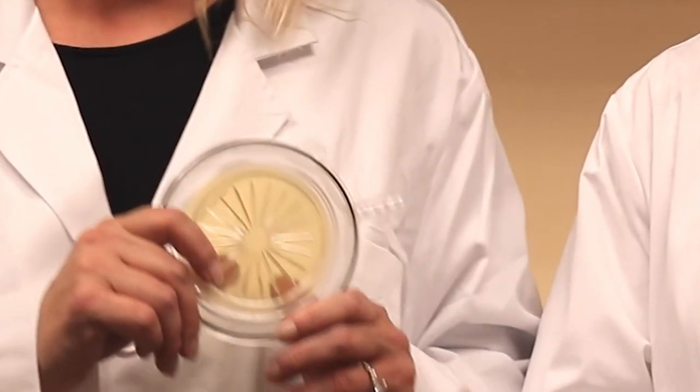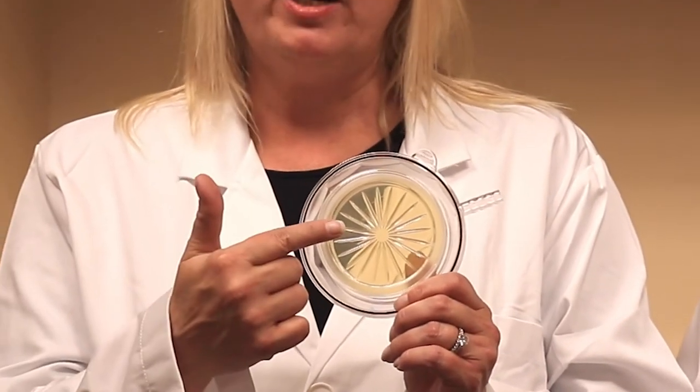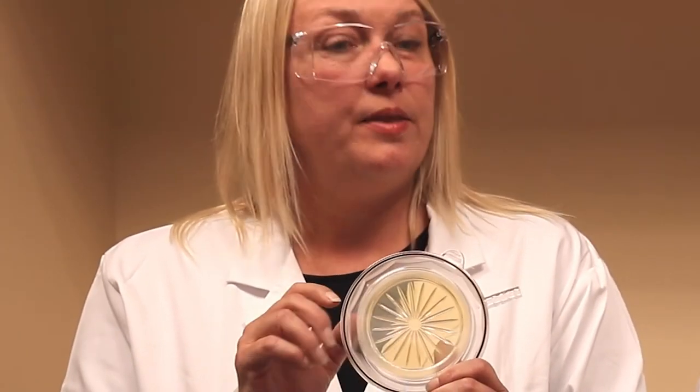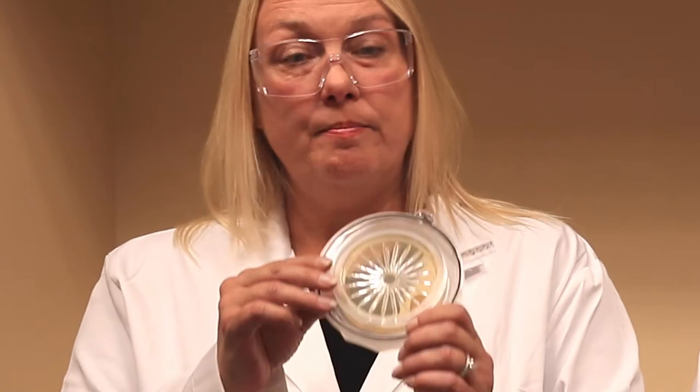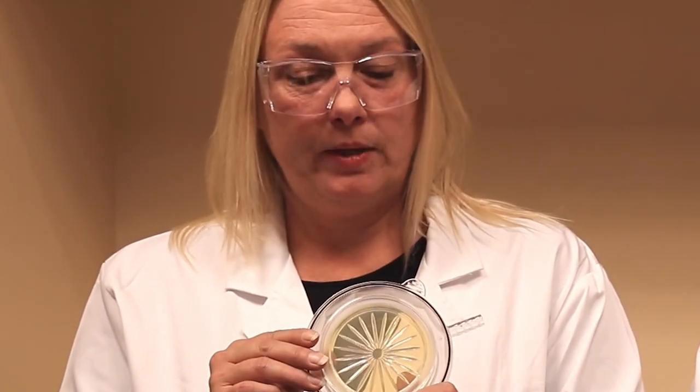Why use the 100 liter per minute BioCap Single Use? These are for a quick sample of 10 minutes. These were specifically made for grade C and D clean rooms. These are great for anyone that doesn't have an autoclave, or for someone who just needs to take a quick sample and be finished. When the sample is complete, you take it back to QC, read your plate, and then you can dispose of it.